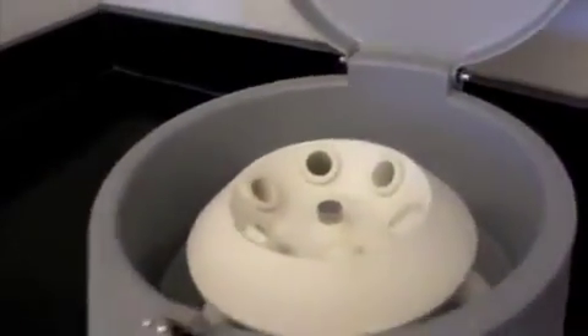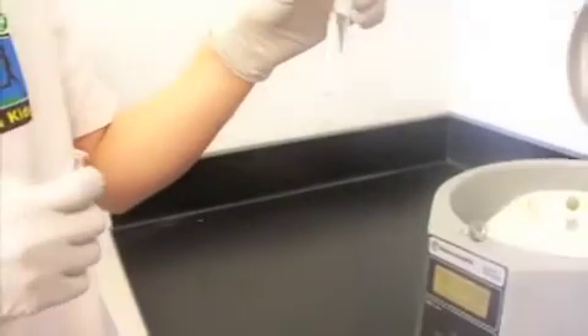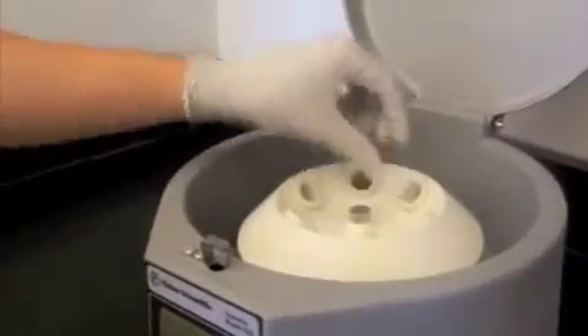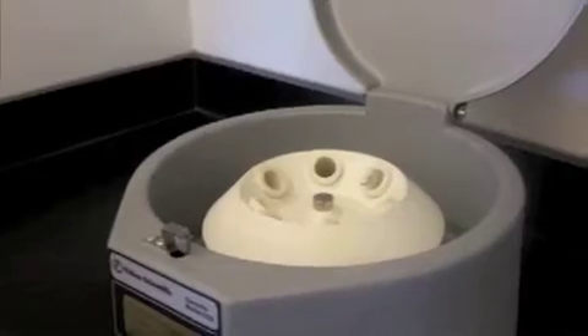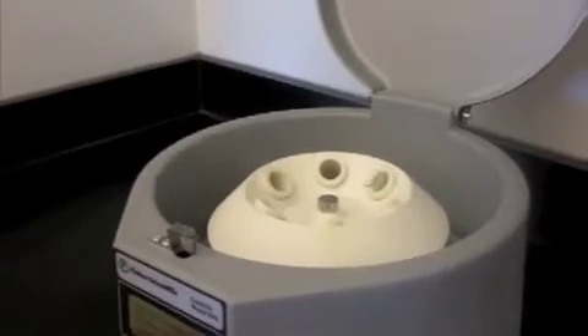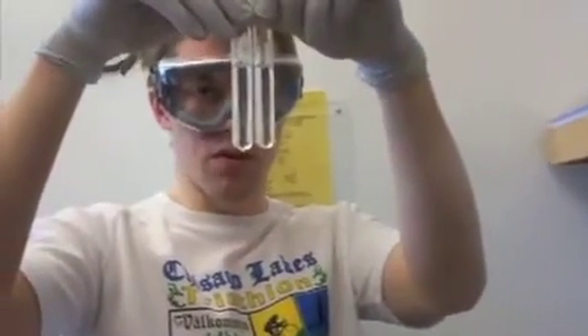When you have your sample — say I have a sample of this much chemical — you don't want to just put one in there, because that would unbalance the rotor and cause it to spin violently and damage the centrifuge. So even if you only have one, get a partner or get a test tube of water and just balance it out. You can see it is fairly much the same volume.